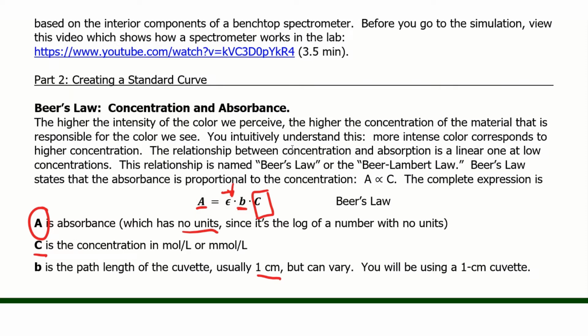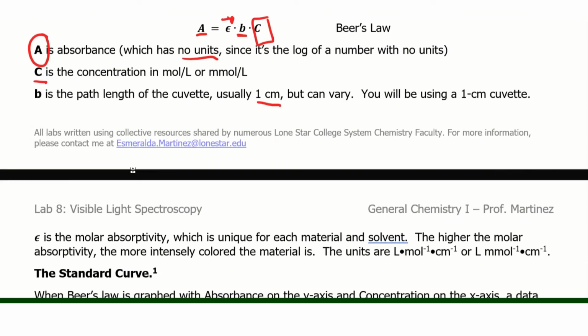It relates concentration and absorption. You may see this law again if you ever take biochemistry, which is why I want to introduce it to you right now, just because I think it's useful.